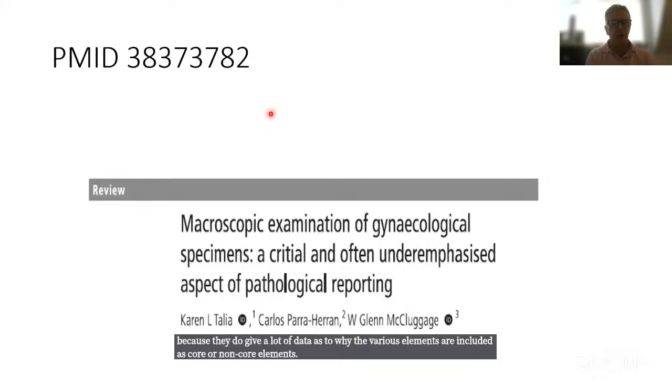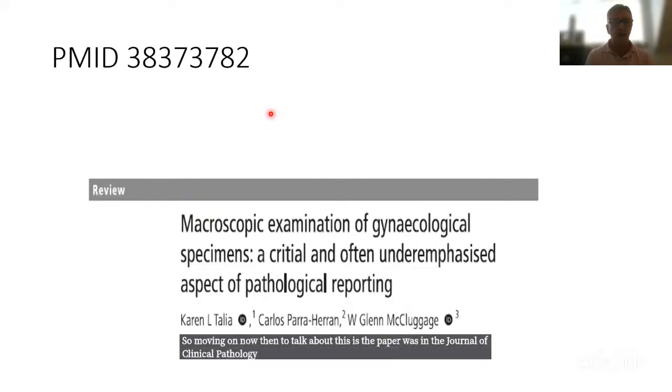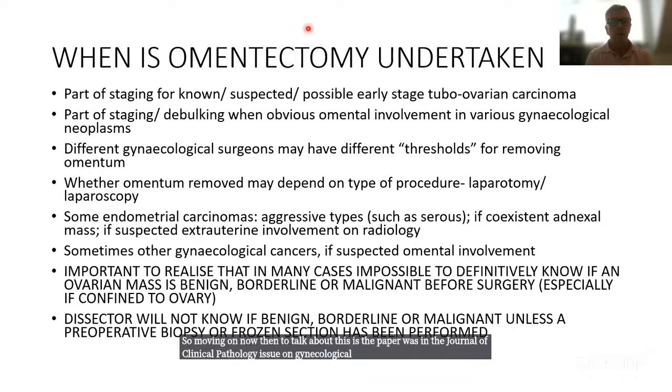So moving on now to talk about this paper, which was in the Journal of Clinical Pathology issue on gynecological specimens. I'm going to start off by talking about omentectomy specimens. And I think one thing which is useful is for you to know, when is omentectomy likely to be undertaken?